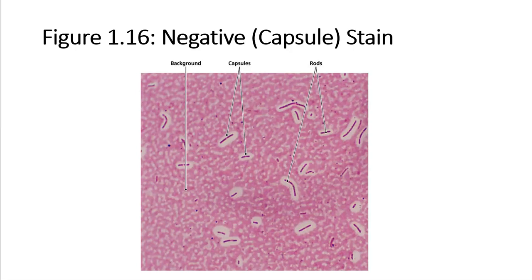But what a negative stain allows us to do is basically to learn that the bacteria have a slight negative charge because of the cell walls. And the stains that we mostly use, your gram stains, acid-fast stains, have a positive charge, so that the negative and positive charges attract.